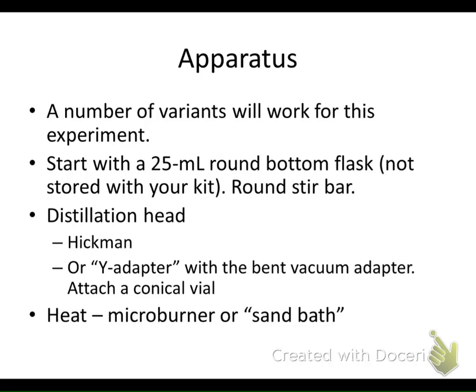There's a number of ways that this works, but what we'll be doing in our experiment is taking clove, grinding it up, or it may already be pre-ground for us, soaking it in water, and then putting that soaked clove oil liquid mess that we're going to make in a 25 ml round bottom flask. You'll add a stir bar, and that's actually a very important point.